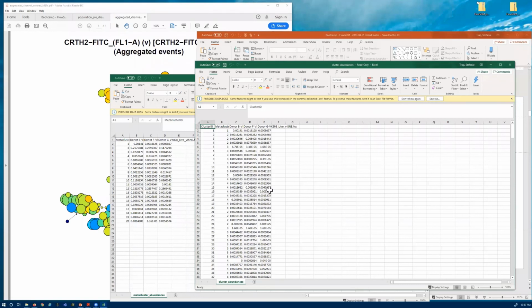Perfect, thank you so much. Can we merge clusters? Steph? Yeah, so I'll go through and show that.